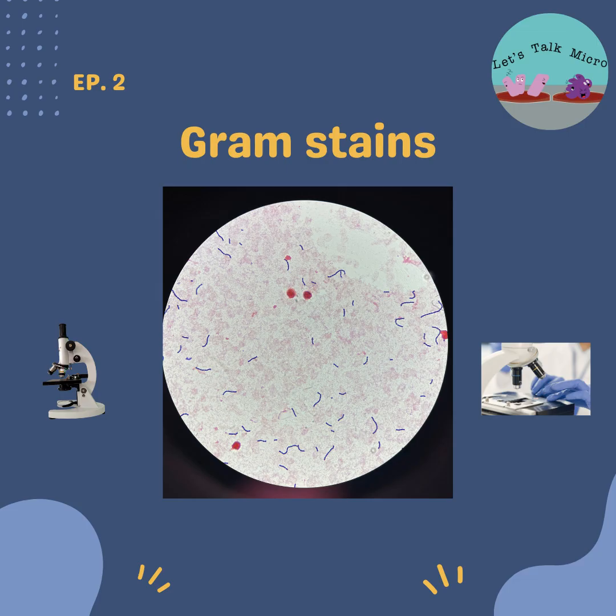I think the one time that an automated stainer helped me was with an Acinetobacter. For those of you that know micro, Acinetobacter can stain purple sometimes. It is a gram negative rod, but it's plump, it's cocobacillary, and it can stain purple. But we'll talk more about that down the road. I knew it was an Acinetobacter, but it kept staining completely purple. I put it on that automated stainer, and it actually came out pink. I felt much better when I reported my result as an Acinetobacter. So that's a positive experience that I have about an automated stainer.